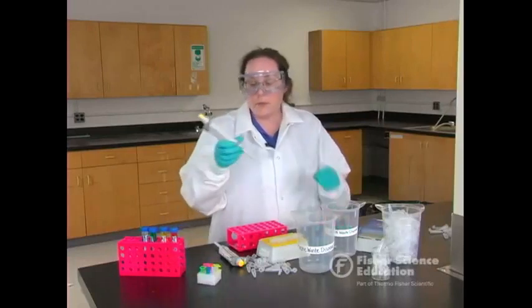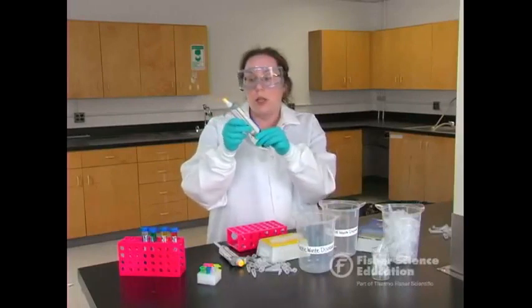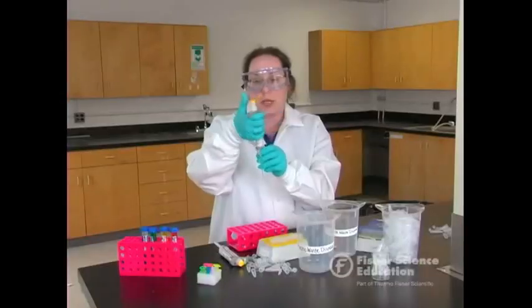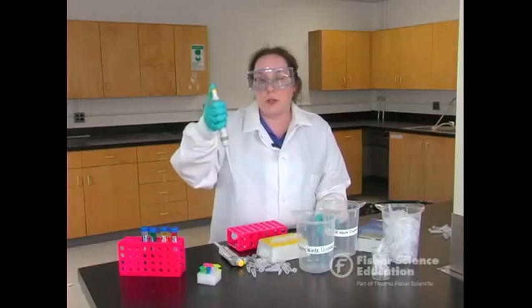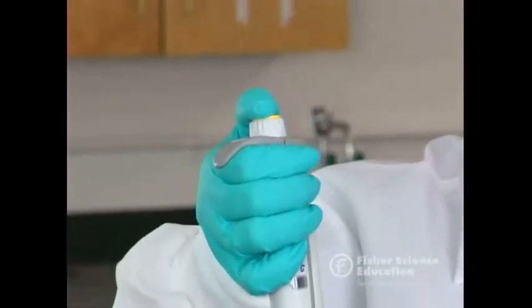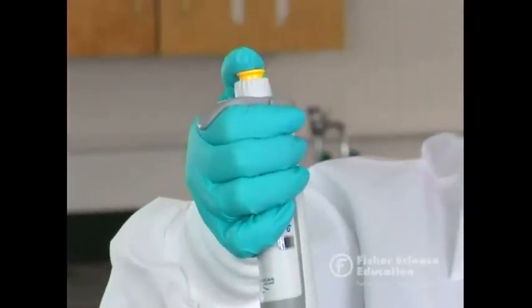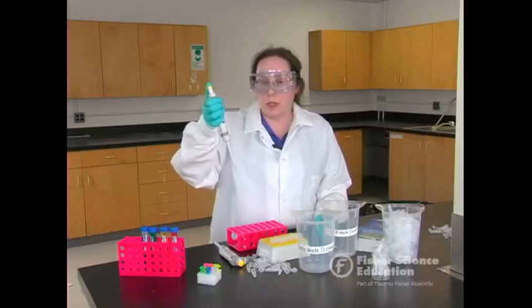So this is a pipetter. You always want to make sure that you've got a tip on it when you use it, but I want to get you acquainted with how it works. There's always going to be this hook back here that's going to hook over your hand, and you're going to depress the plunger with your thumb. On the pipette, there are actually two stops, so you can push once and then twice. And they're very creatively named the first stop and the second stop. And so you want to make sure that when you're filling your pipetter, you know which stop you're at.